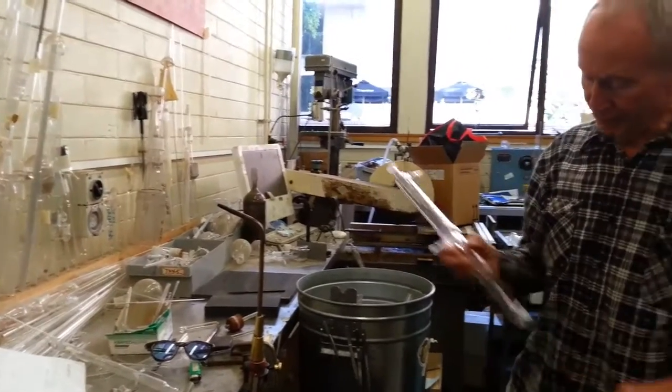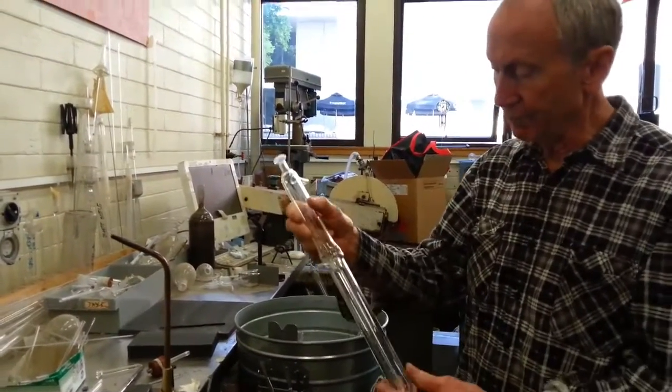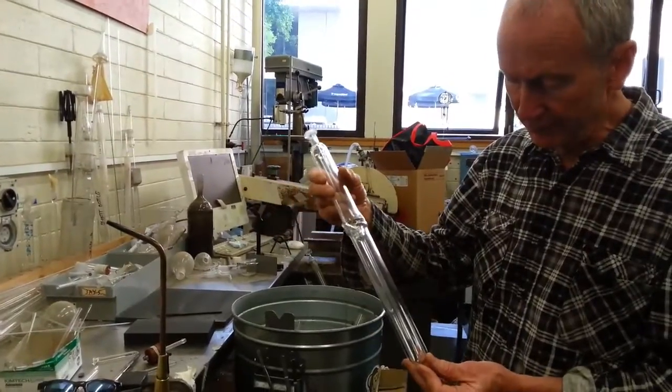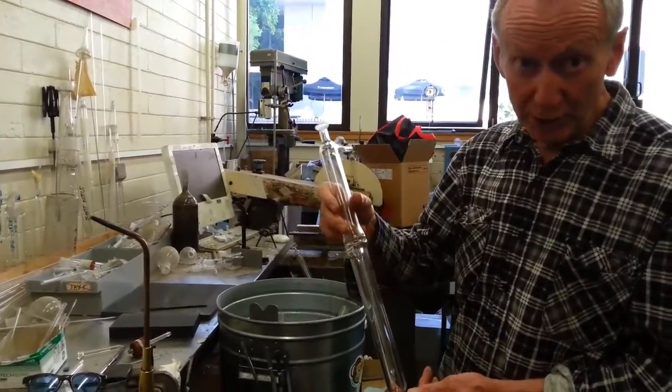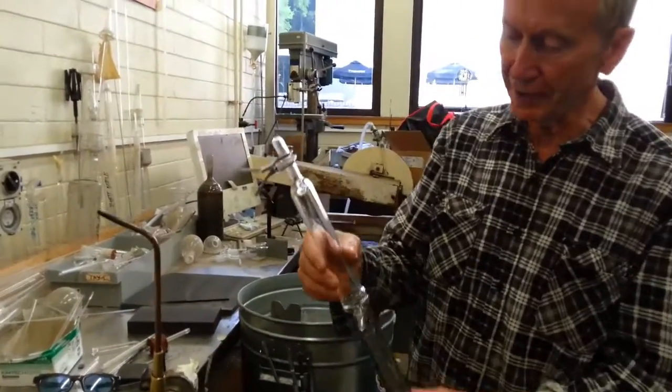I'm not allowed to use mercury in a lot of the labs anymore. And this is a bubbler I'm playing around with at the moment for Schlenk work. I've got to put a ball valve in here. I've got a spring in it.